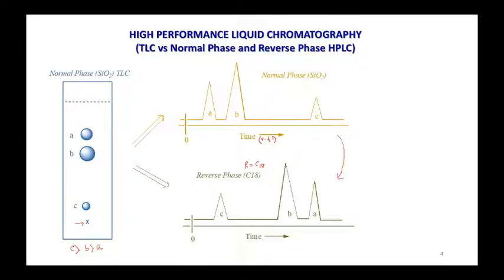So regular phase or the normal phase TLC is a good indication that you can have the prediction what type of column you can use. Okay, and if you remember, in most of the cases we use the separation of polar compounds, right? We generally don't deal with very non-polar compounds. We generally deal with the polar compounds, and your reverse phase column will be more favorable over normal phase column. Because you are interested to separate the most polar compound, your expectation will be the most polar compound should come early. Okay, and that's why the reverse phase is preferred over the normal phase.